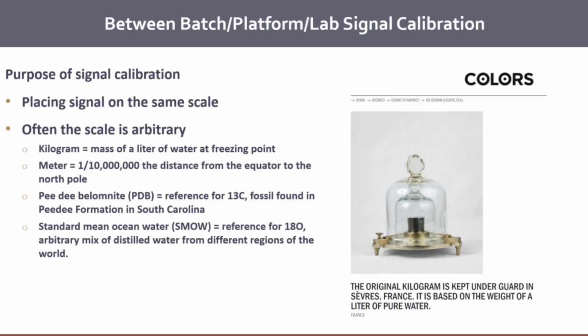The goal here is to have a reference value of which you call it a number, that the community eventually agrees on that number, and that becomes a reference standard. In fact, there's now been some discussions that maybe NIST will host things like plasma values, and then what we'll do is eventually crowdsource the actual abundance of proteins within that plasma sample, that then we get to enough consensus of what we call the amount of that protein in that plasma sample. If not, everybody just assumes it's 1, right? Or it's a delta value from that individual value. But it's nice to have an actual assigned number, right, to it.